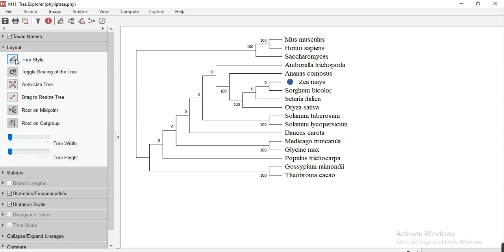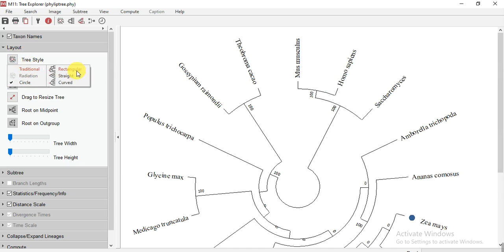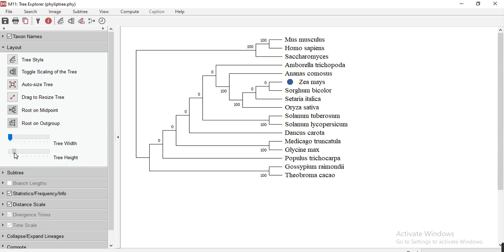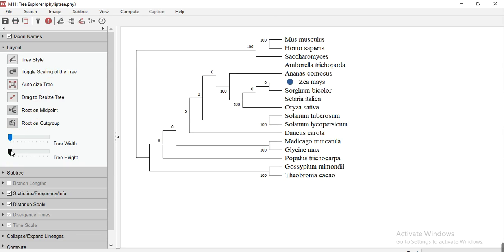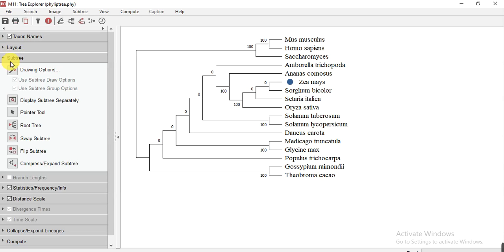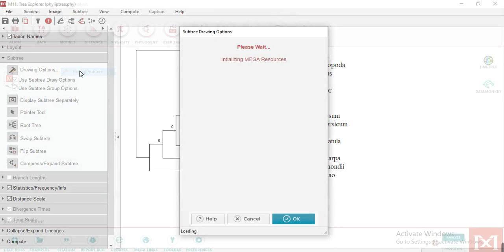Now you will go to layout. And from here, which style you want, either circular or traditional rectangle or anyone. From here you can move the text from down or upward or like this. Here you can increase the tree height and then width.